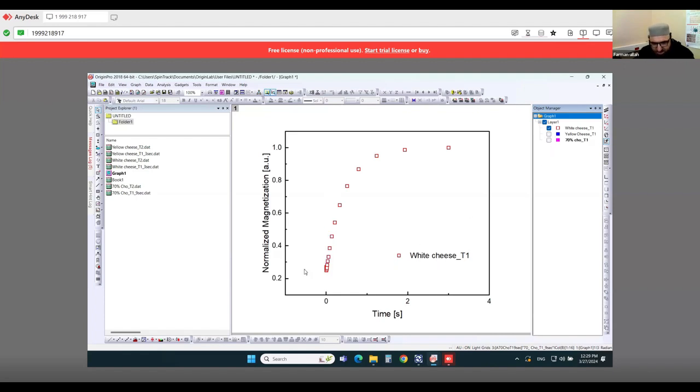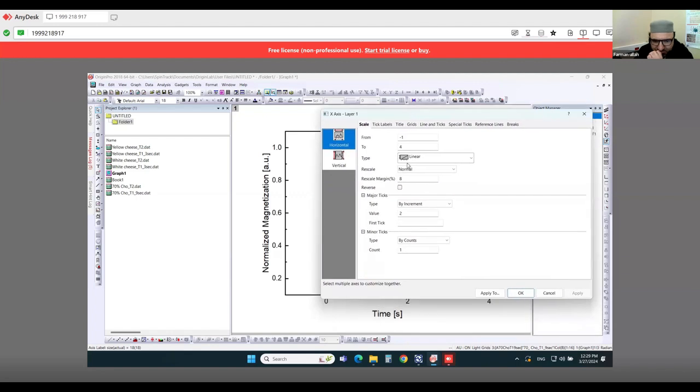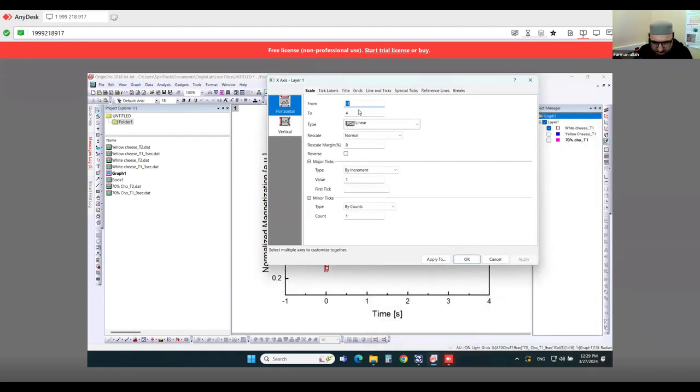So I will arrange this, and again I will set the parameters. The value difference is 2. I will take it 0.5. Okay, sorry, 0.5 is also taking 1. And the starting is, you see, I will take minus 0.05. Now see what's happened.